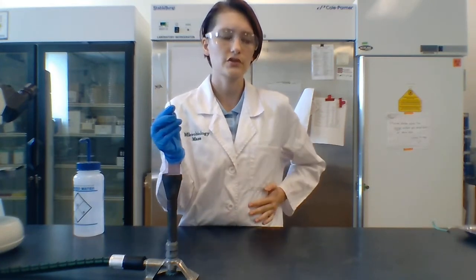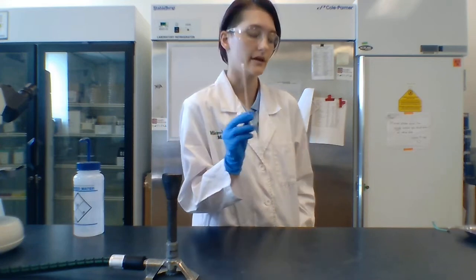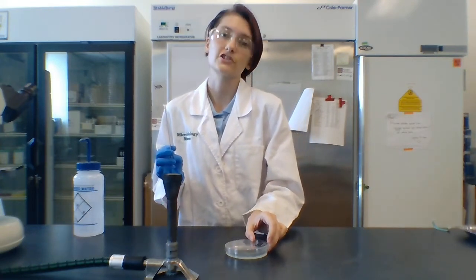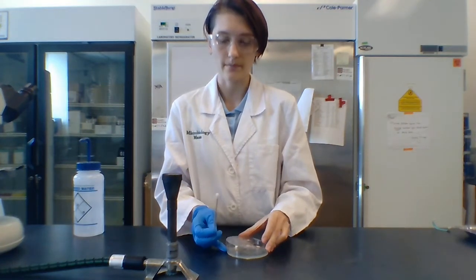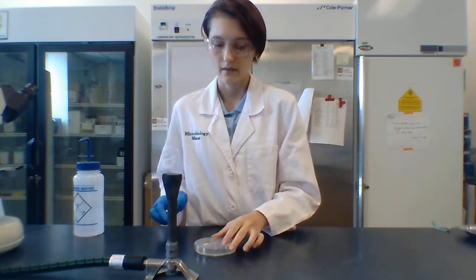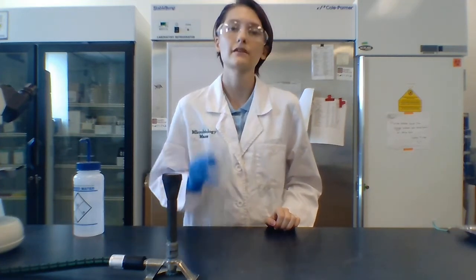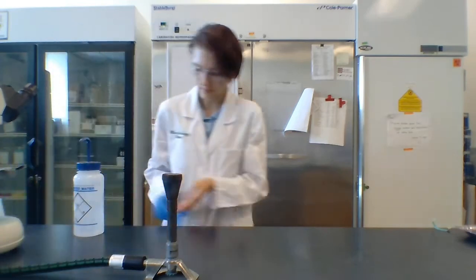But there's not enough germs on this cotton swab to look at in a microscope, so what do we do then? In that case, we need to culture it, right? So we're going to take an agar plate, which is basically science jello, right? So what we're going to do is put the germs onto the agar, and that is going to feed them so that they grow and so that we have enough to do experiments on. So we're going to grow that in an incubator for 24 hours. And that's just going to give us enough germs so that we can pick them up and look at and do lots of other fun things to them. Let me put on another glove.